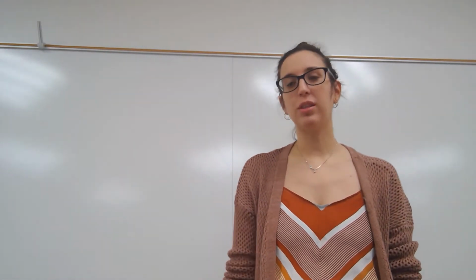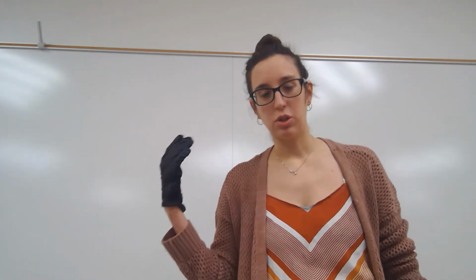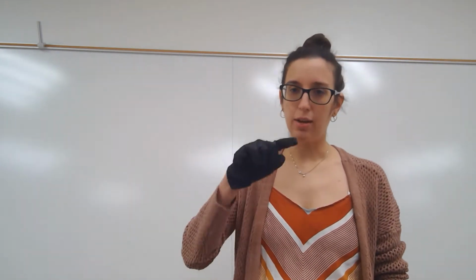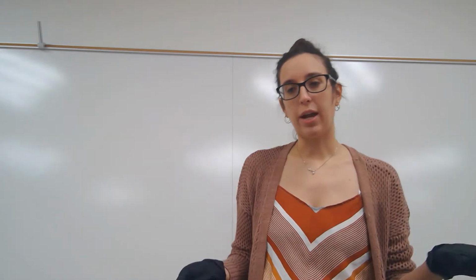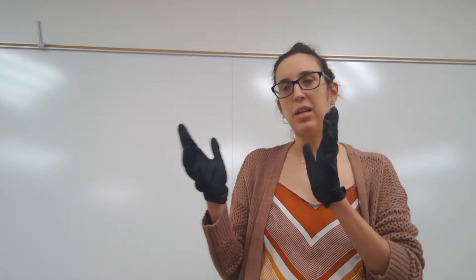I'm going to be doing the nitrate reduction lab today. So the nitrate reduction lab is a lab that helps us understand how bacteria can change nitrate, which is NO3, into reduced forms of it, which can be nitrite.